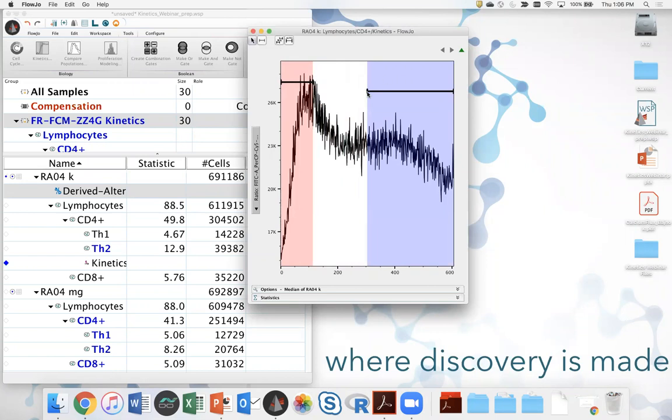So typically what I'm looking for in a calcium flux experiment, or in any kind of kinetics experiment, I should be sure to generalize, is that I expect to see some kind of response and then a steady state period where the system generally starts returning towards normal. And so perhaps I want to separate those two portions of the data to characterize the speed, the duration, the magnitude of the response, and perhaps I want to characterize the duration of the steady state period, how long it persists for, and what its magnitude is. There's a few ways one might go about doing that.